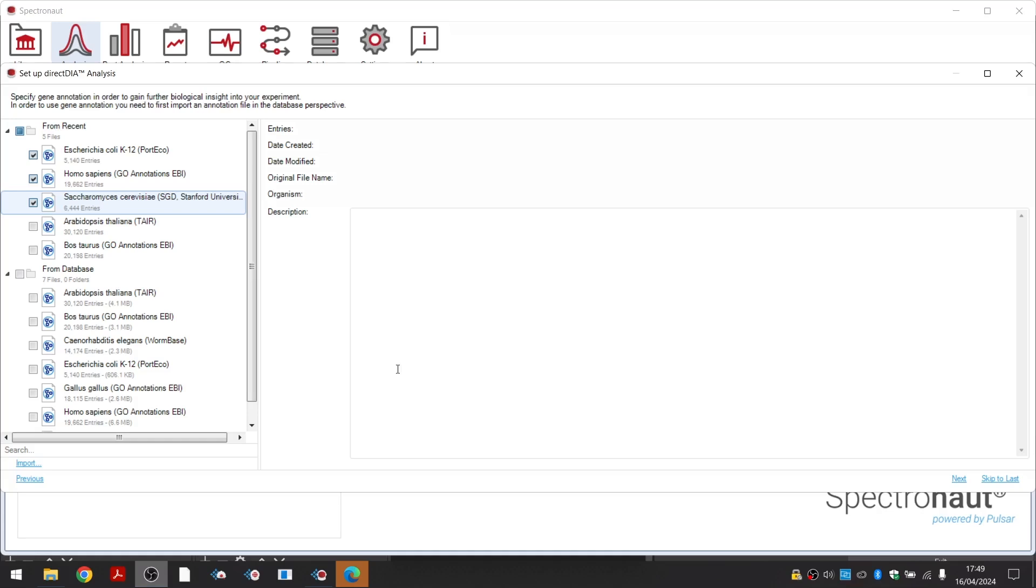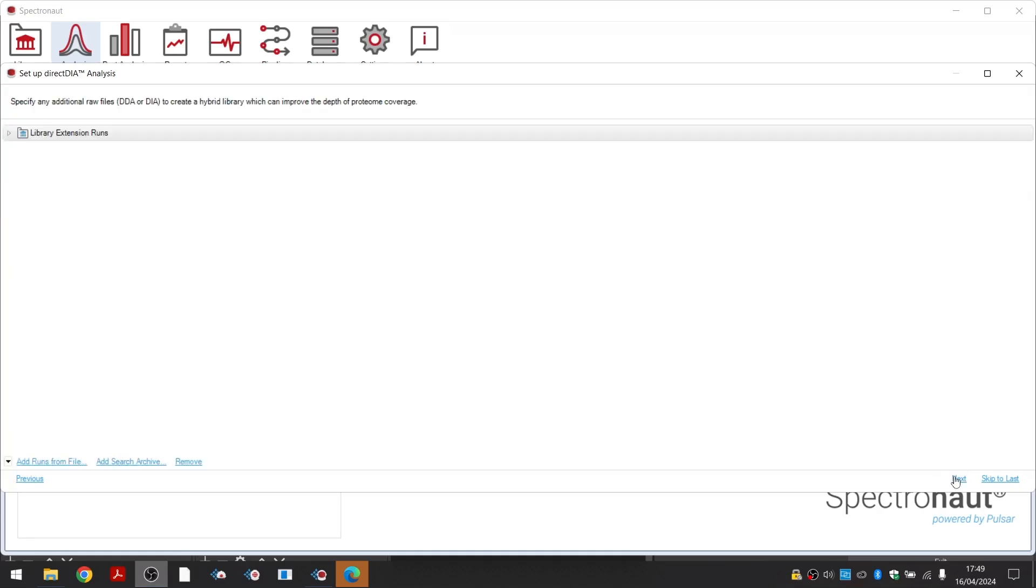Finally, you will be able to add extension runs, which will be used for generation of the search space in Pulsar. Here you can upload raw DIA or DDA runs, including files acquired after sample fractionation or acquired with different LC gradients.